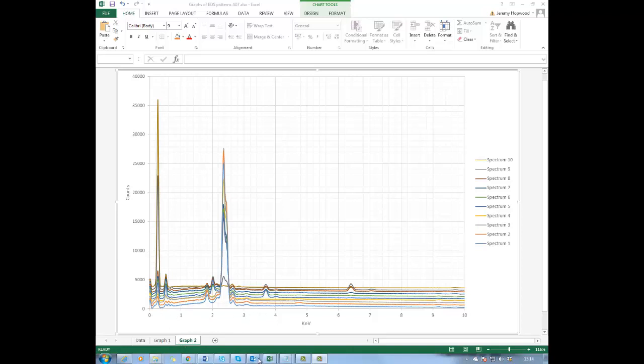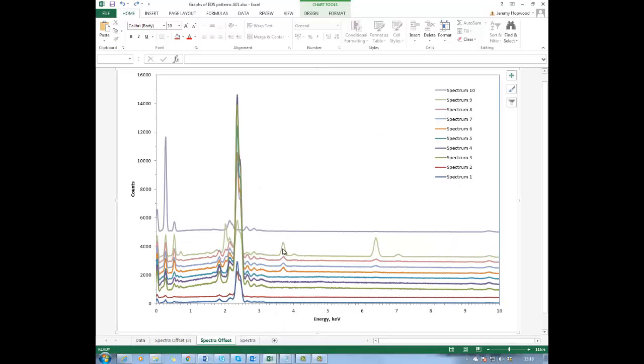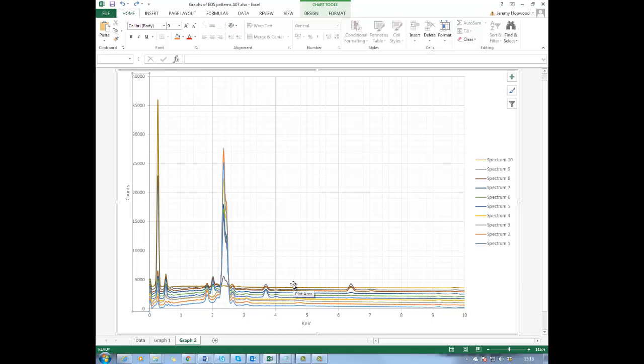So I'm going to just change the axes. So this is my graph. Basically, I want the graphs to look so similar to all the graphs in sort of style. So this is the graph that we've got so far, and then if we go to look, this is the graph that's closer to what I wanted. That, remember, we're going to change eventually into this one here, but this one looks closer to it, and you can see there's an adequate amount of spacing, and you can sort of distinguish the different peaks. If I go to the graph that we've just done, it's harder to do so because, like I said, they're all pressed together.